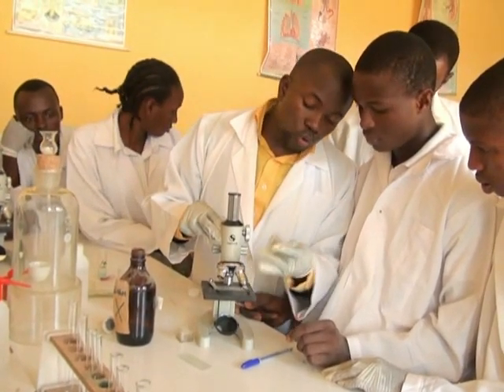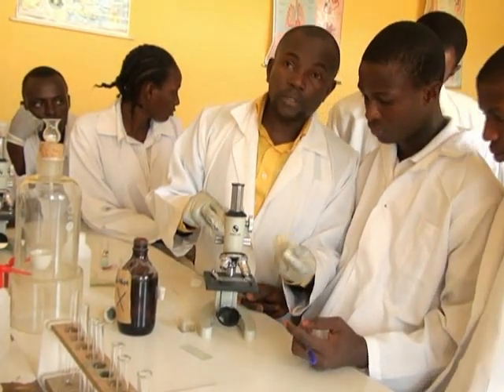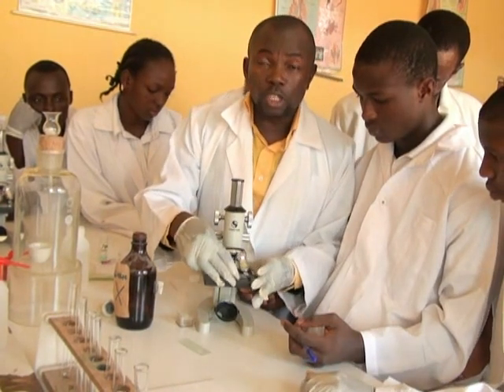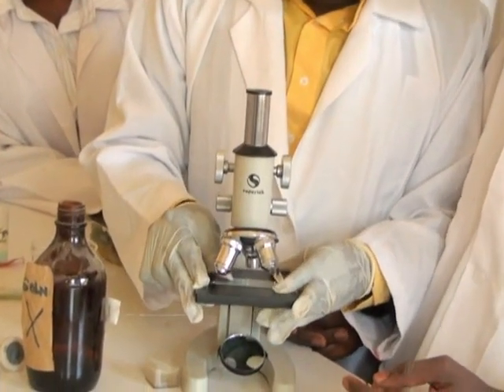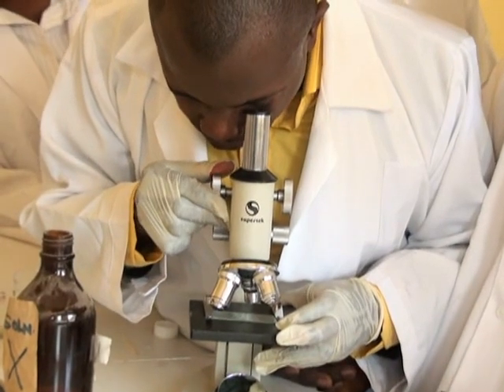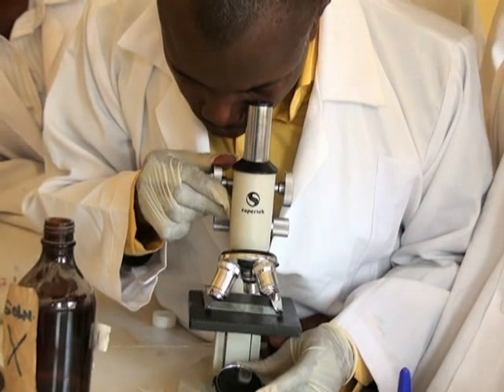We can also use times 40, times 60, but it is always better to start with the lower power, which is times what? 10. So we examine the animal cell under the microscope.